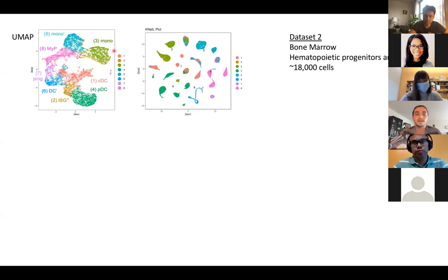To put it into context, we had spent almost 10 to 12 months already using tSNE and UMAP approaches. And when we jumped into KNetL, it's been maybe just a couple of months, and we've really increased how much useful information we can pull out of this data set, I don't know, tenfold. So Joe, I have a couple of questions.